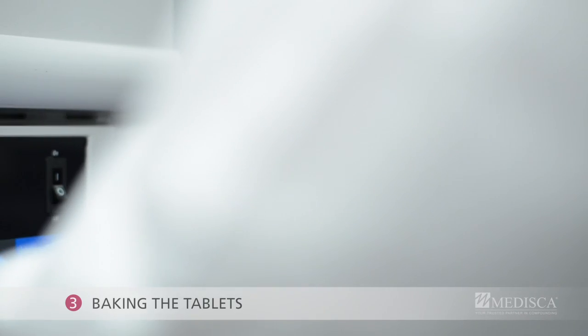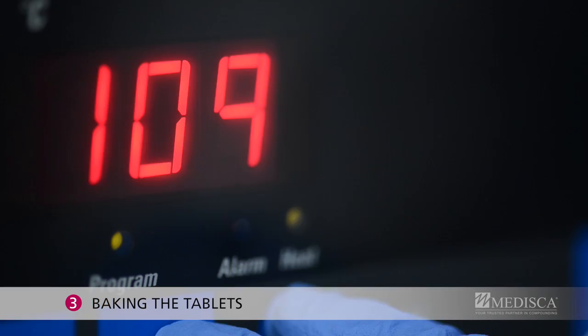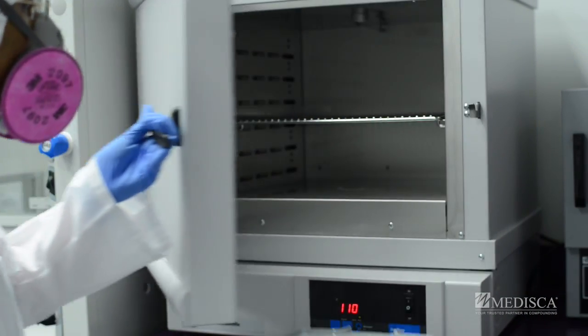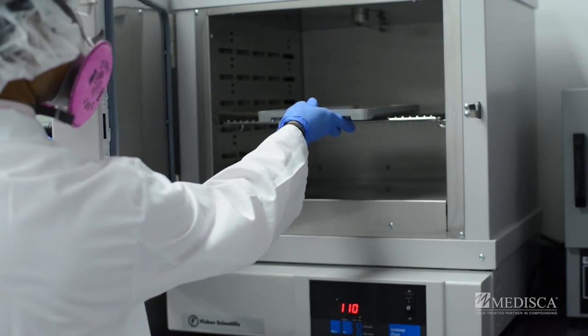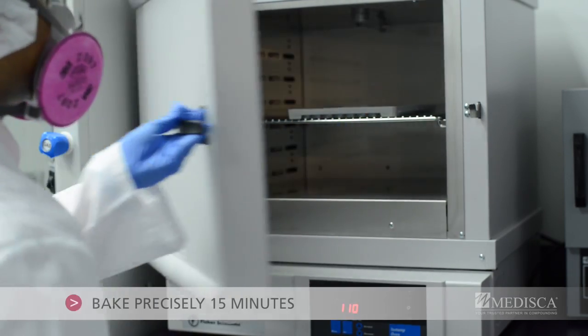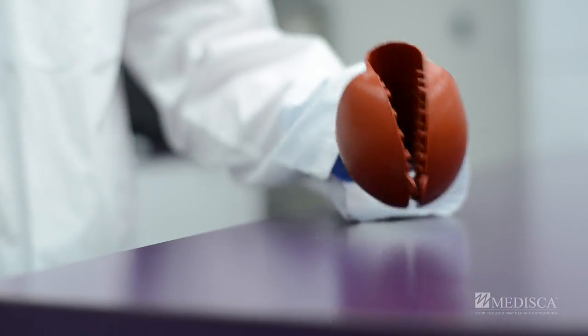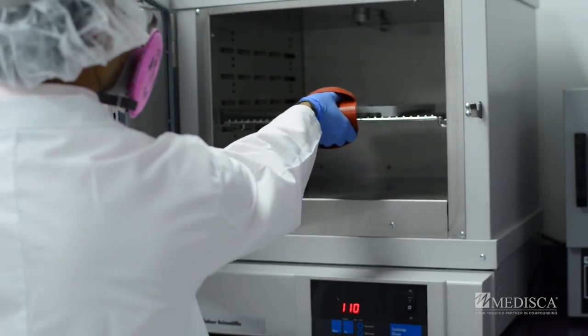Step 3: Baking the tablets. Preheat a convection oven to 110 degrees Celsius. Place the filled mold base plate only on the middle rack and bake for precisely 15 minutes. Then with your hot hand protector, carefully remove the mold from the oven.